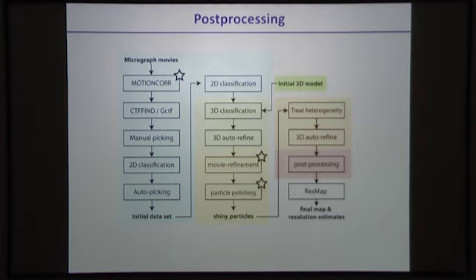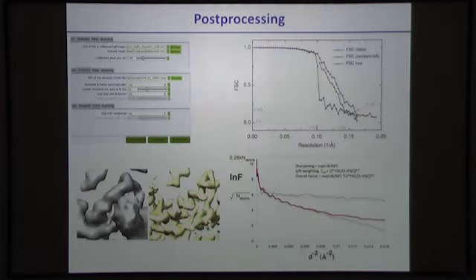Okay, so now, after doing refinement, in order to prevent overfitting, when RELION does the FSC comparison between the 2 half maps in order to estimate resolution, it's not going to use a mask to calculate this FSC. So the estimation of the resolution is going to be underestimated during refinement. This doesn't affect the reconstruction or the estimation of the angles because this is driven mainly by lower frequency components.